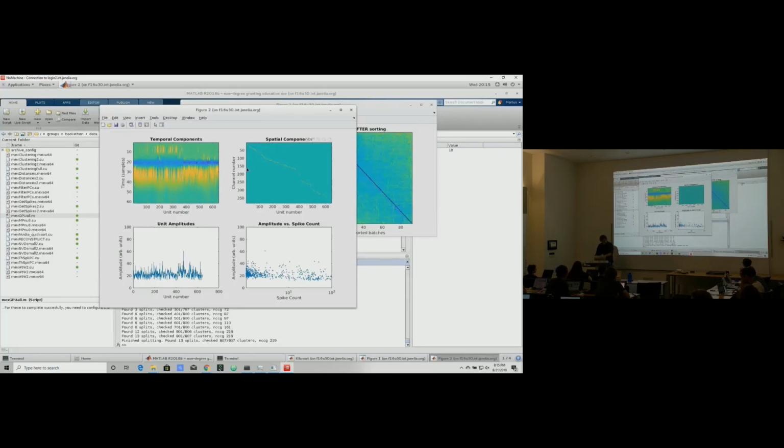Okay, so that's what these plots are. Any questions about these four plots? They just exist there to give you a bit of quick feedback of how you're doing, a quick sense of what's in the data, and whether the optimization is working.